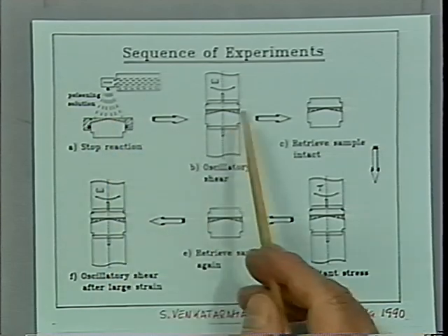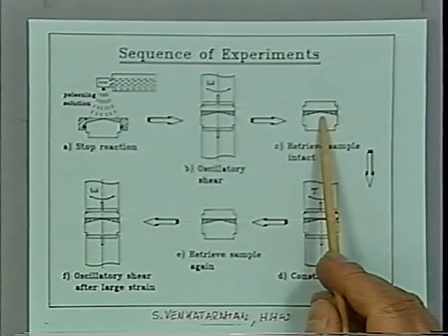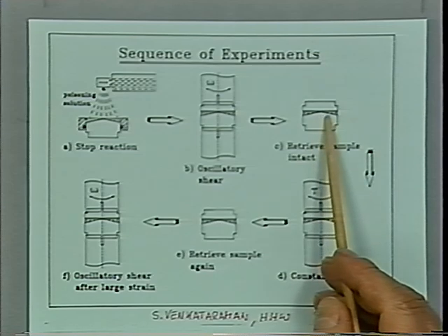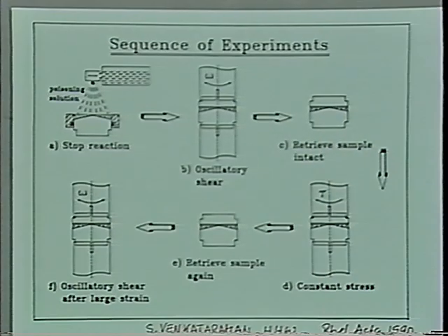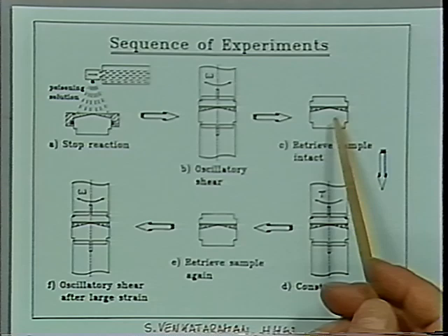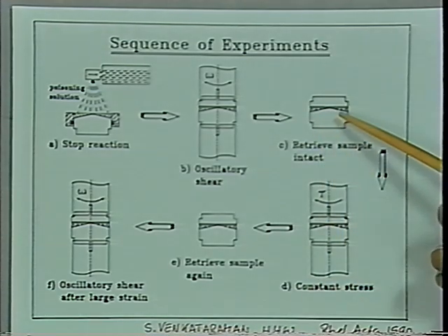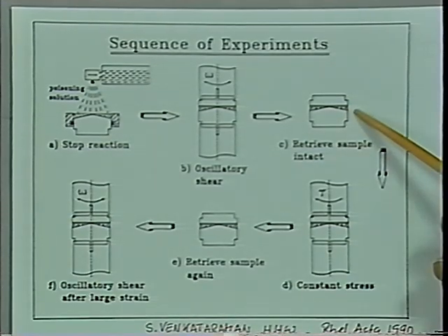The reaction is stopped, can be put in a rheometer, and then we could perform a dynamic mechanical test to look at the dynamic mechanical properties, and then see whether our sample, which we produced, is close to the gel point, whether it's a sol or gel or wherever it is in the evolution. So we would use rheology to characterize the system.